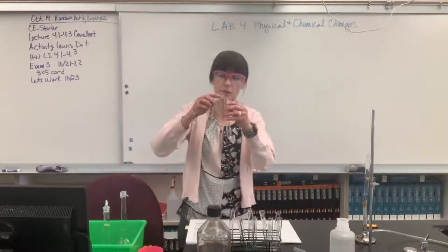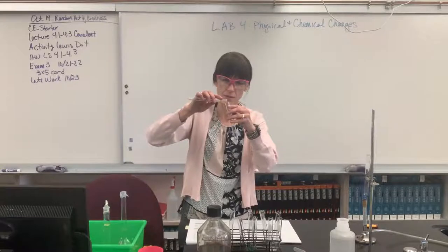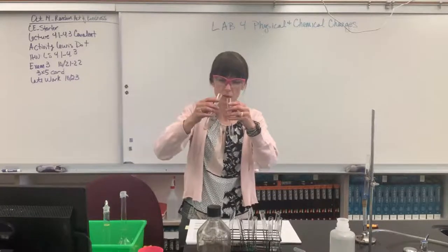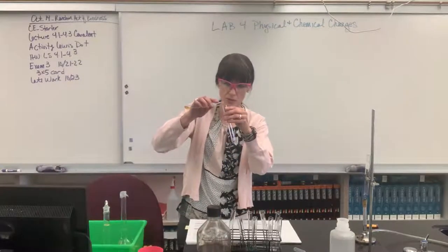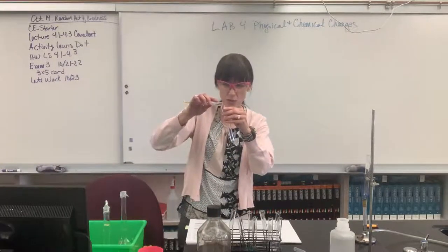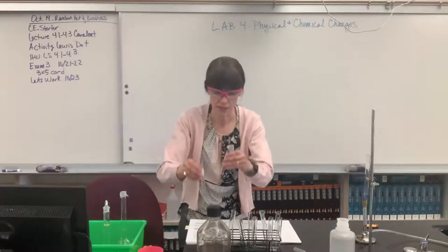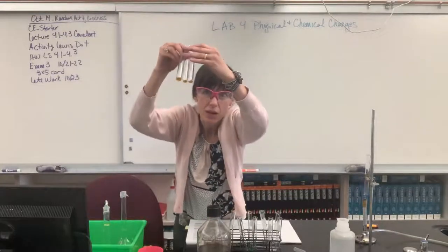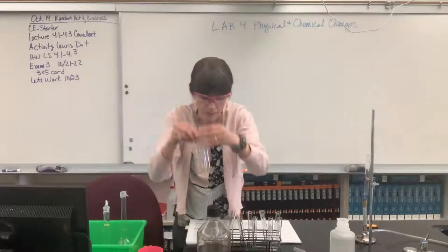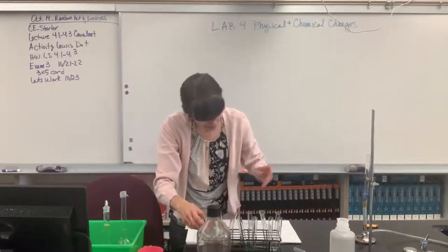So we are going to pour 10 drops into that one, and then we're going to pour 10 drops into this one. So I have three test tubes total that have 10 drops. So there's three test tubes and they all have that yellow at the bottom, the iron 3 chloride. Okay, so we did that.